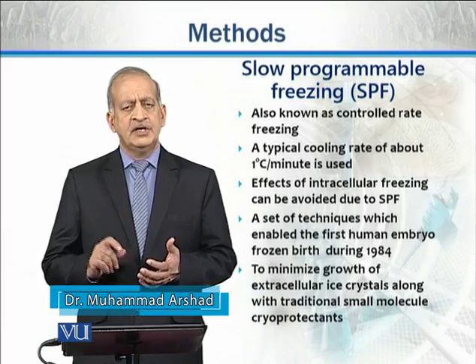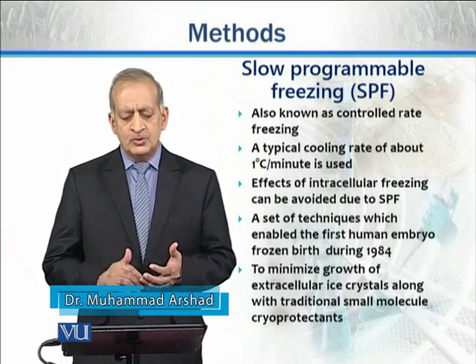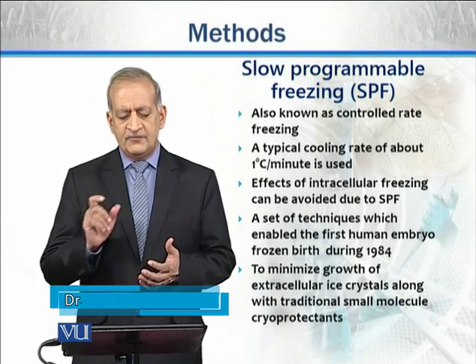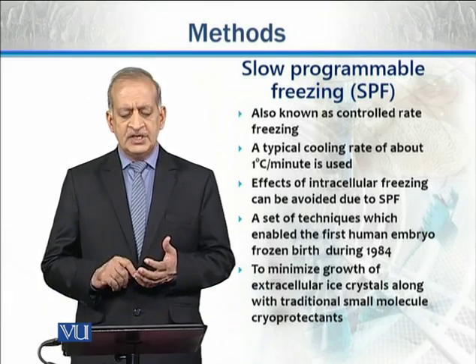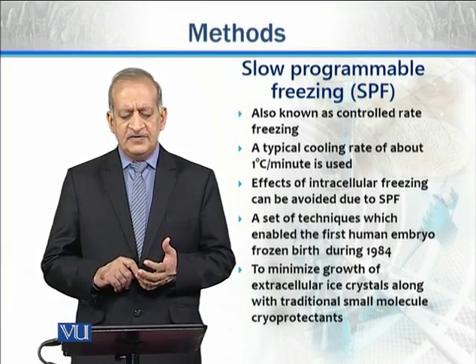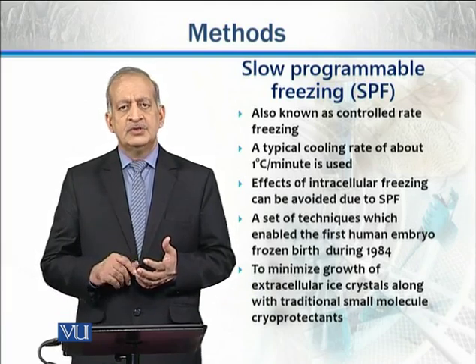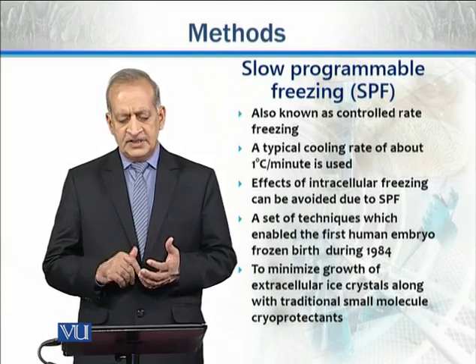I told you that we can freeze at a faster rate, but that will be harmful for the cells and for the tissues. Effects of intracellular freezing can be avoided due to this slow freezing.